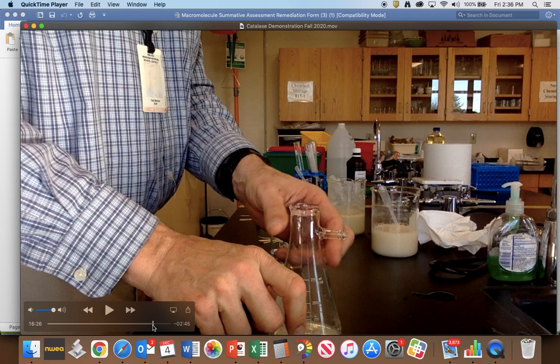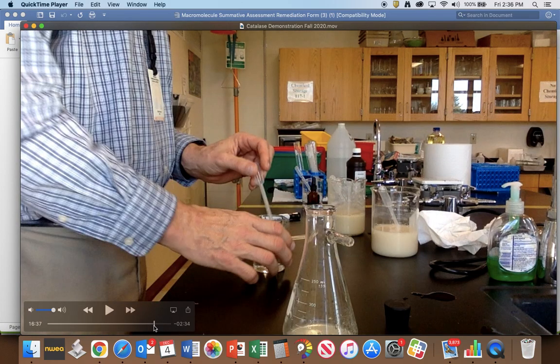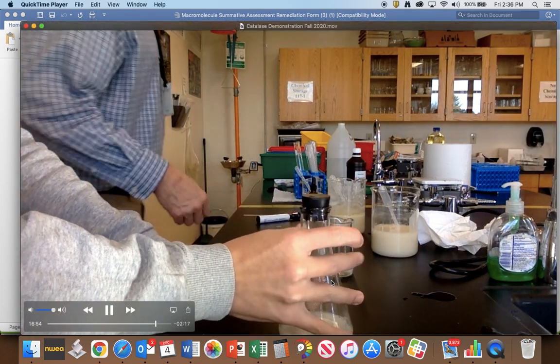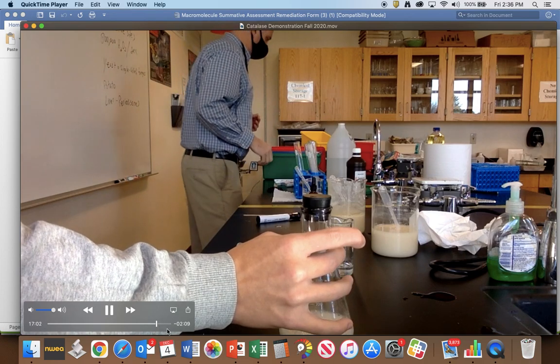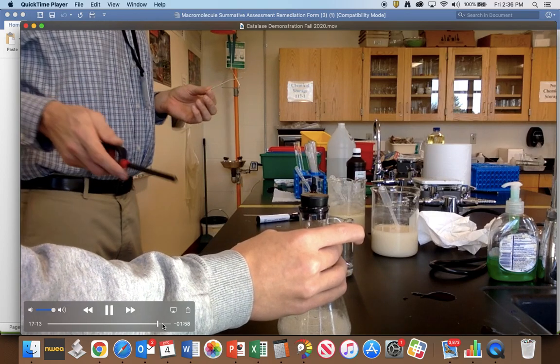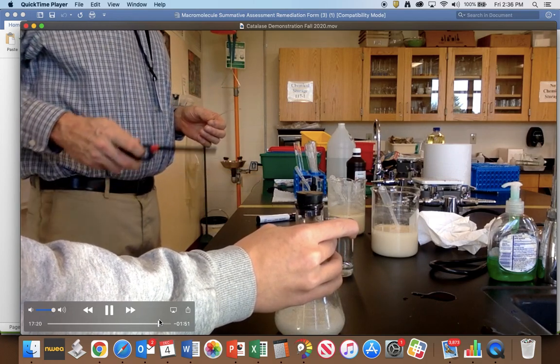And in this experiment, we're going to test whether hydrogen gas or oxygen gas was being produced. Because the original equation I gave you, it was oxygen gas. But let's just see if that's true. I added some good yeast in there. Now I'm going to add a bunch of hydrogen peroxide and put a top on. I have someone helping me hold that closed. And we're going to light a stick on fire, blow it out, and if the stick relights inside the container, that means oxygen gas is being produced. If it was hydrogen gas, it would explode.